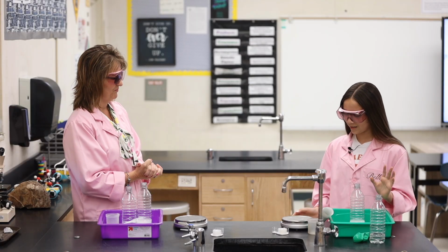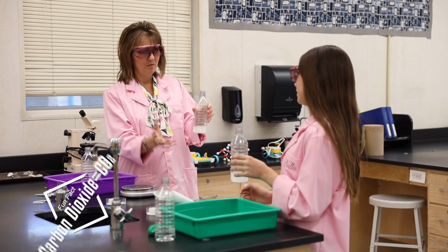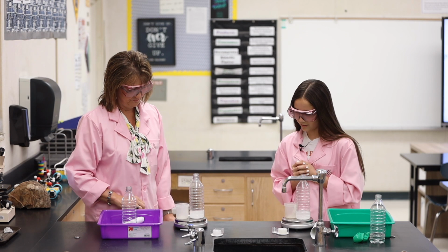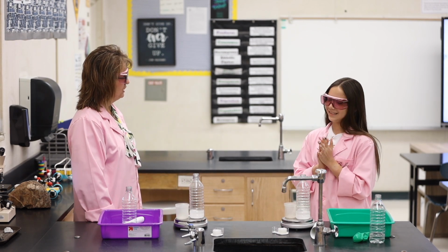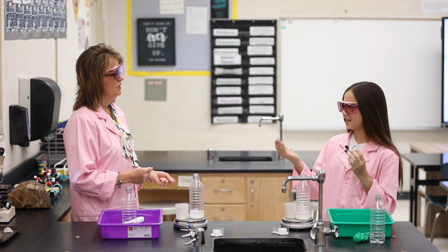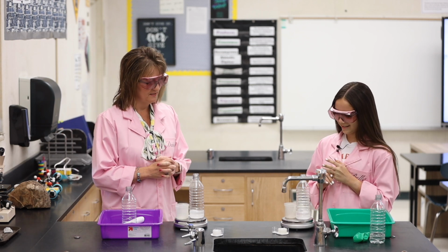Okay, so now we're gonna go ahead and measure this again. So now that was just a chemical reaction that happened, correct? It created carbon dioxide. So now we're measuring the combination together. Go ahead and add the beaker too. Okay, so now mine is 136. Ooh, and mine is 138. So it lost weight overall, because since the top wasn't covered, the carbon dioxide escaped, and so that's what caused it to lose some weight. Okay, that makes absolute sense.